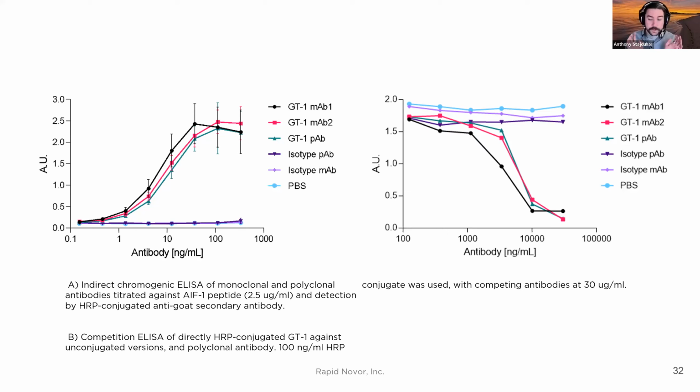When we do a lot of these polyclonal sequencing projects, we don't know what we're getting into necessarily with respect to the number of antibodies that we expect to see. In this case, very small antigen, many immunizations over a long period of time. I think we're closer to the more conservative end of things.